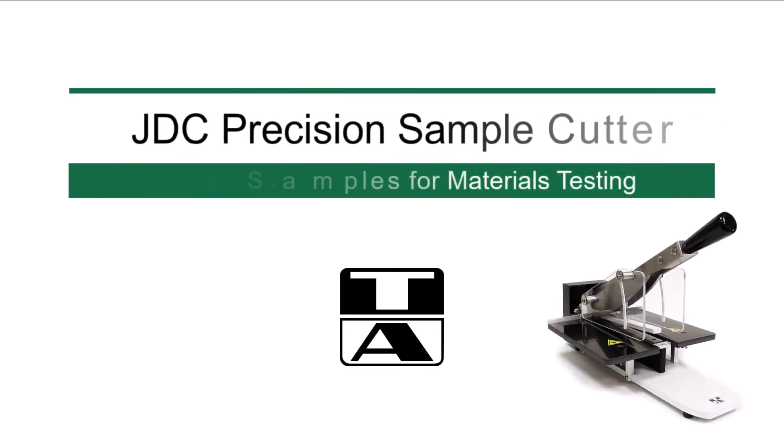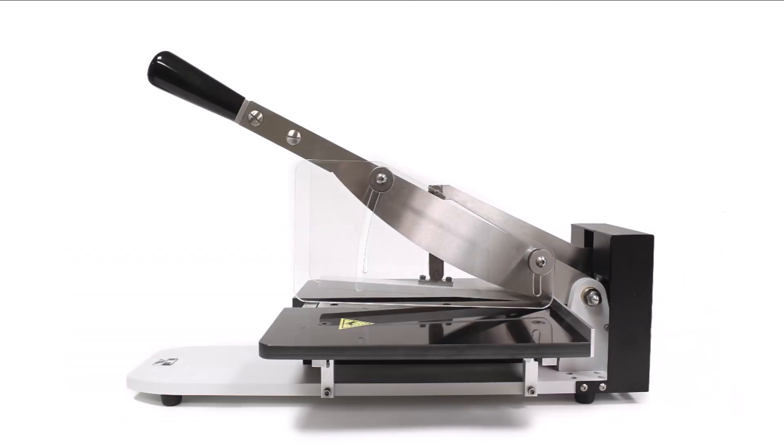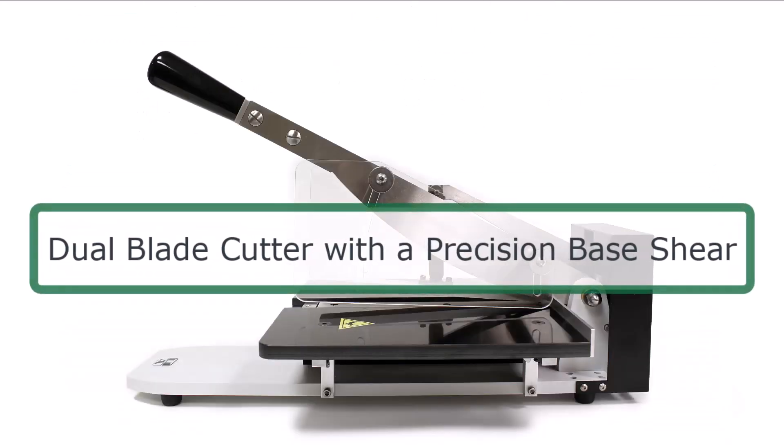The JDC Precision Sample Cutter offers exceptional cutting accuracy and features dual action blade cutting for superior quality cuts.